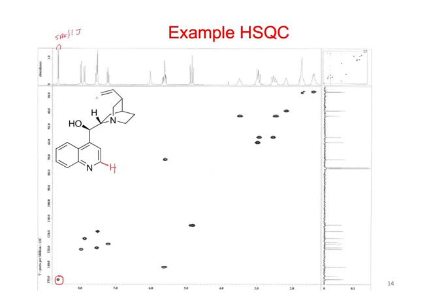And these ones next to the nitrogen tend to be kind of small, so I think the other one is over here. It's hard to see, but there's one in there that has a smaller coupling, which would be here. And then notice there's two doublets, and this is a triplet, and probably another triplet under there, and that matches this doublet, triplet, triplet, doublet kind of pattern around that di-substituted benzene.